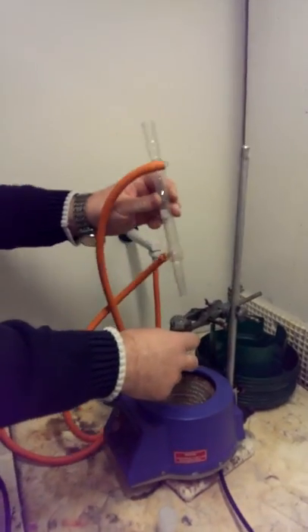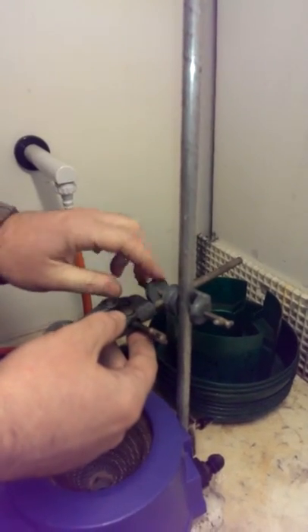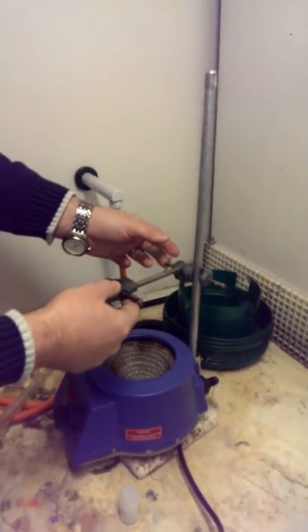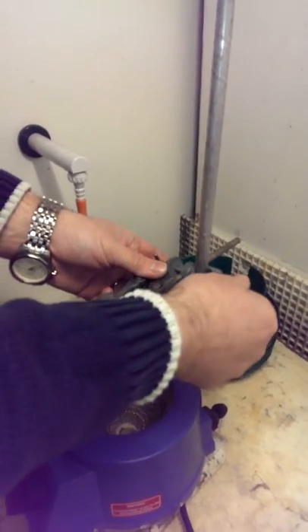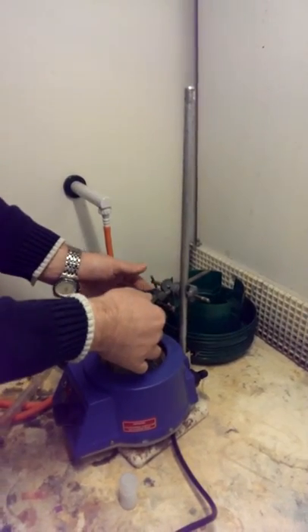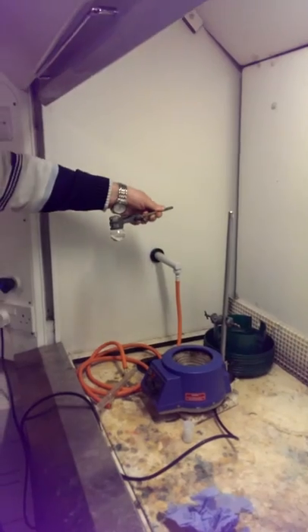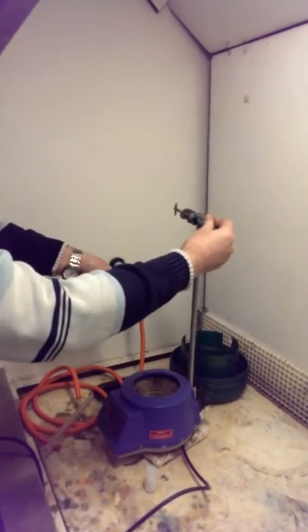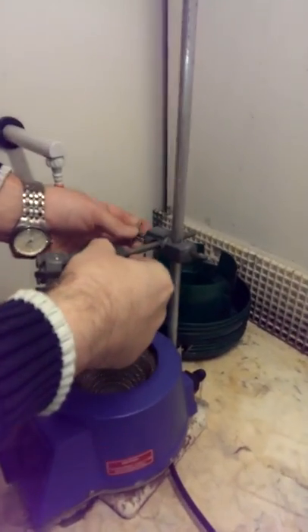Just to point out at this point as well about the clamp boss, we have it where the clamp sits in the boss this way. If there's anything wrong with our setup and we wish to pull the flask away very quickly, obviously we can raise it up and down as follows, but if we wanted to pull the apparatus out, we can release, hold it by the back and move it away quite quickly, away and up from the source of heat, should the refluxing go wrong.